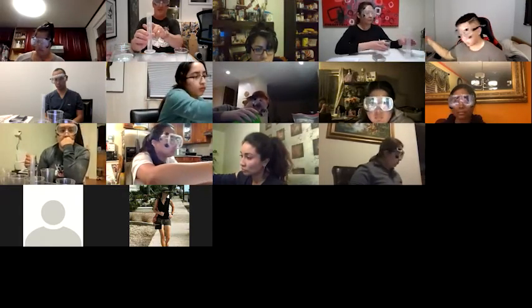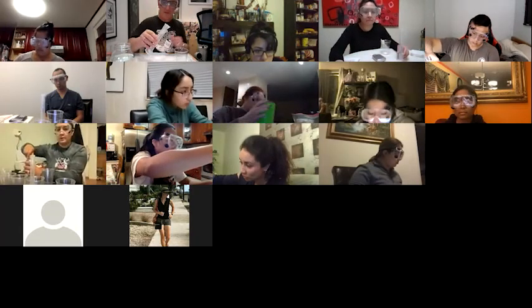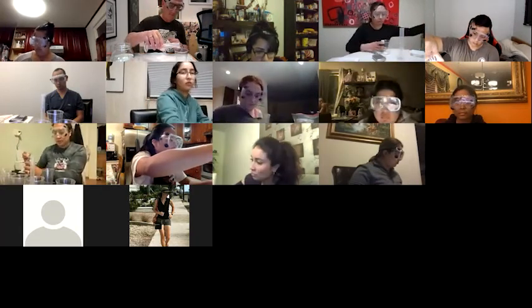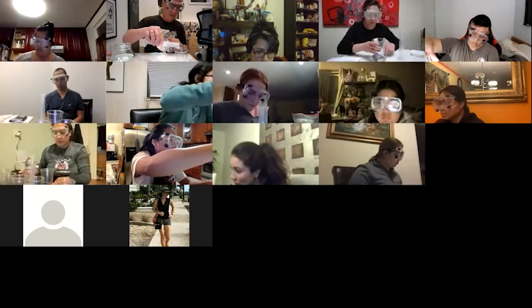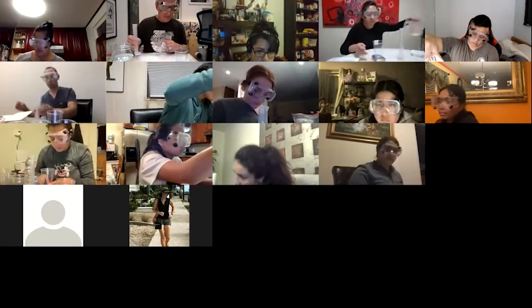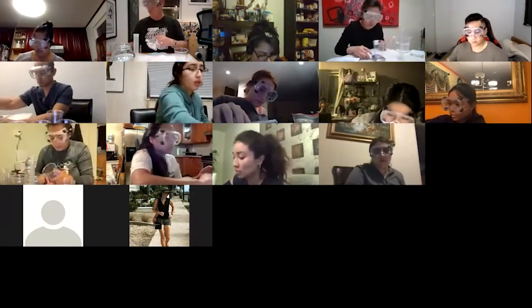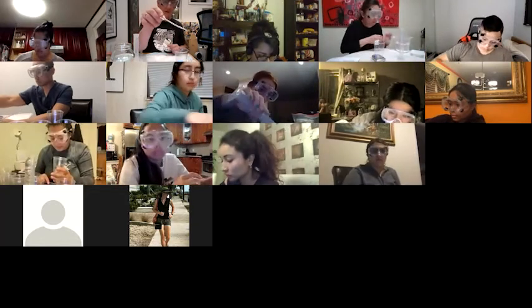Then I'm going to pour from my graduated cylinder into the cup and see what the mass is. And it's a little more, 51.57 grams.